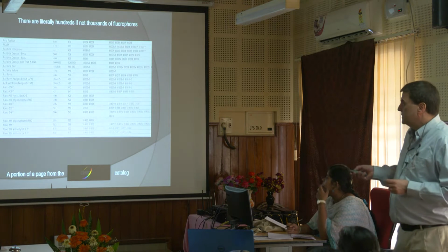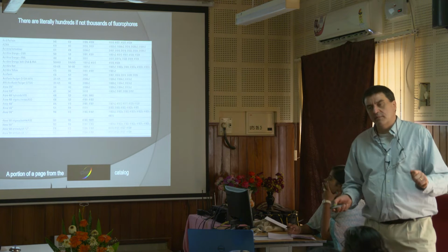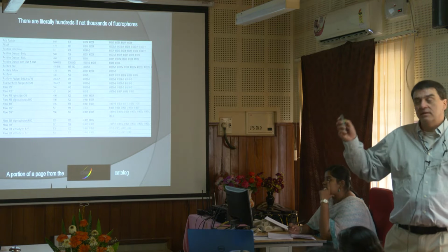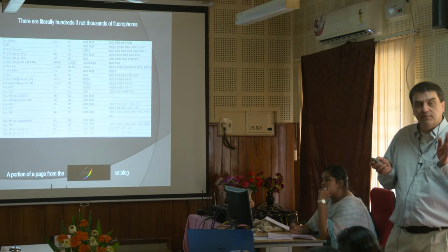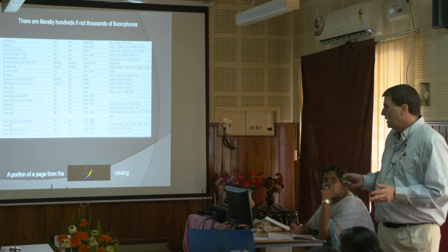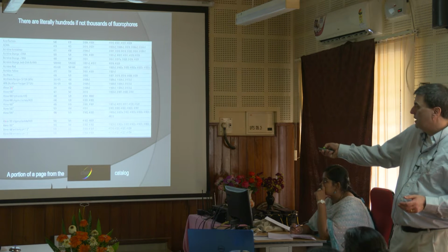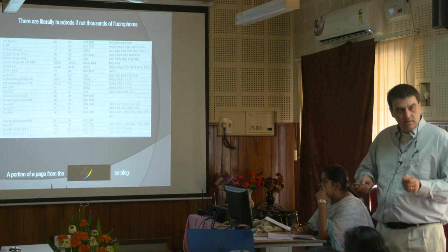Okay, so yesterday we talked about making sure, when you do an experiment with the microscope, that the microscope can see your dye. Because there are now literally hundreds, probably thousands of different dyes and fluorochromes. The companies just keep making them left and right, constantly. This is just part of a page of a catalog, and you can tell it's an alphabetical catalog, and we just barely go into the A's, and you have this many right here. This catalog goes on for pages.